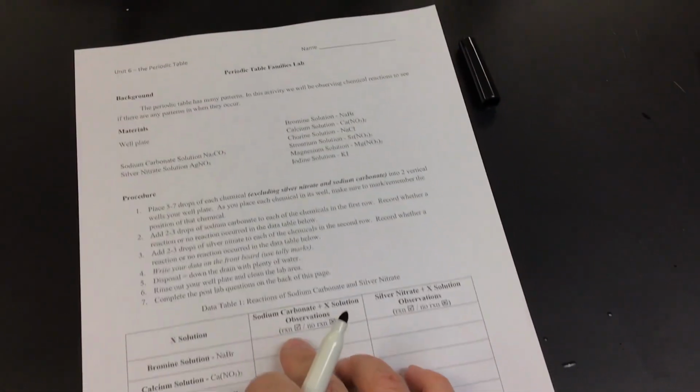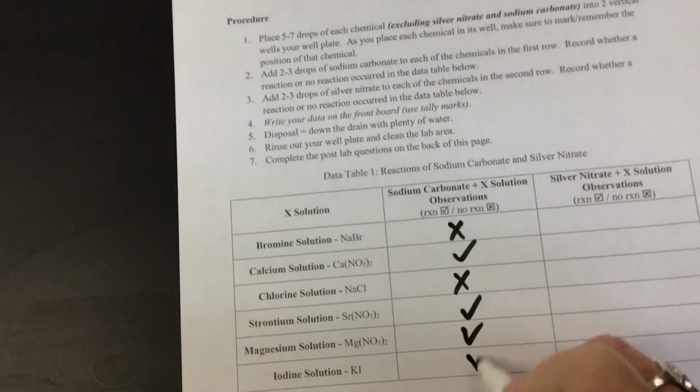Okay, so it says here to put a check for a reaction and an X for no reaction. So for the first one, there was no reaction. For the second one, there was a reaction. For the third one, there was no reaction. For the fourth and fifth, there was a change. And then for the sixth, there was none.